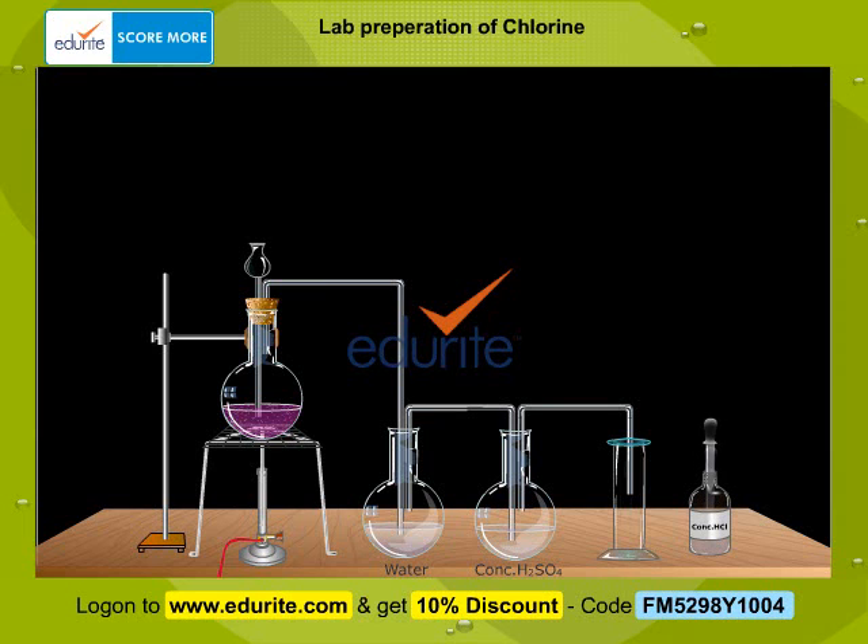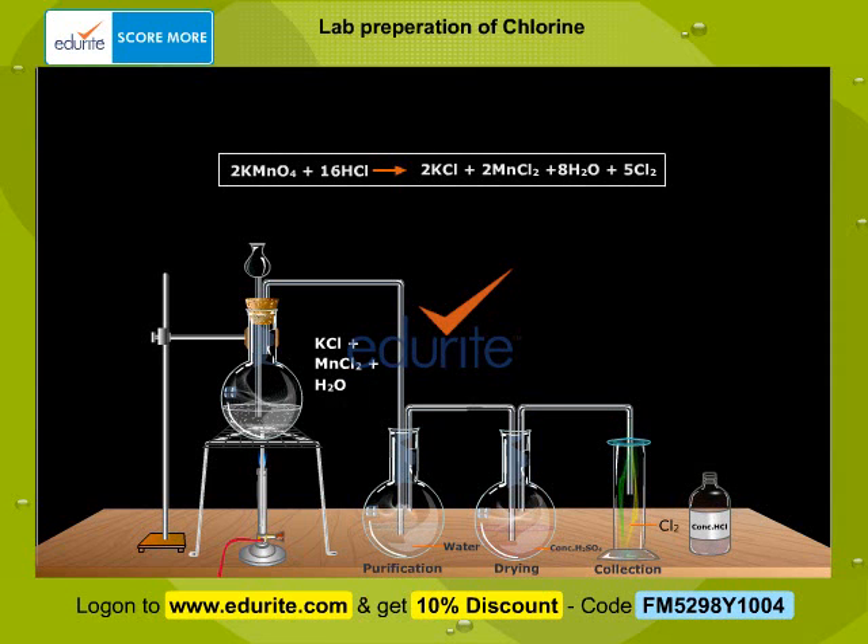Add a few drops of concentrated hydrochloric acid to the potassium permanganate solution through the thistle funnel and observe the reactions that take place. Water purifies the gas, while concentrated sulphuric acid acts as a drying agent.